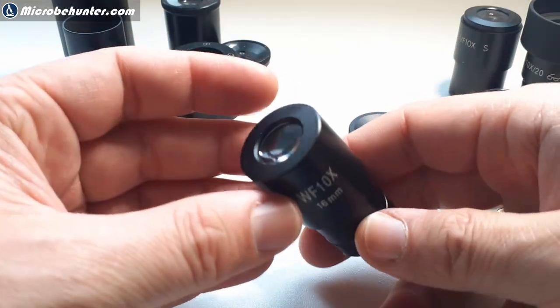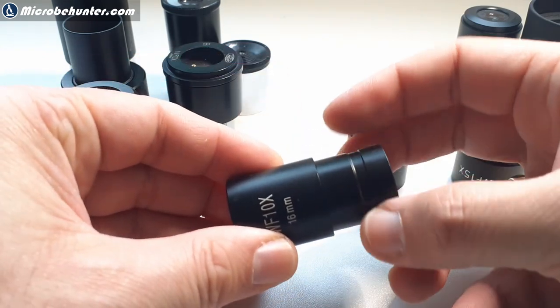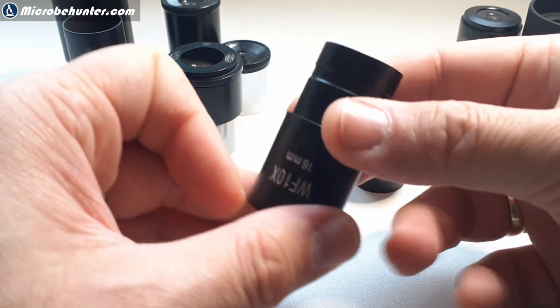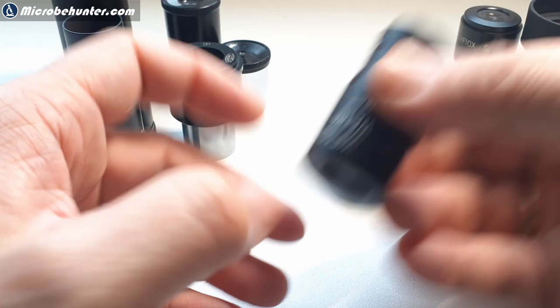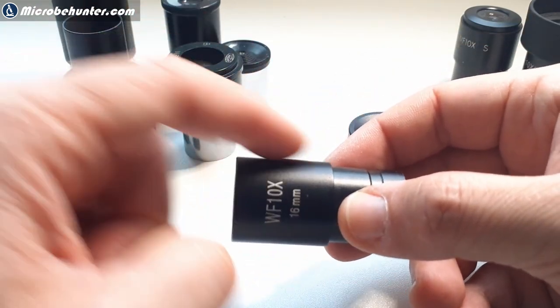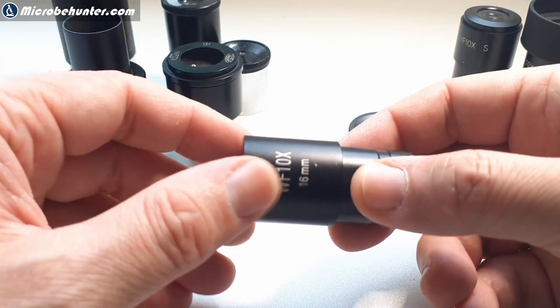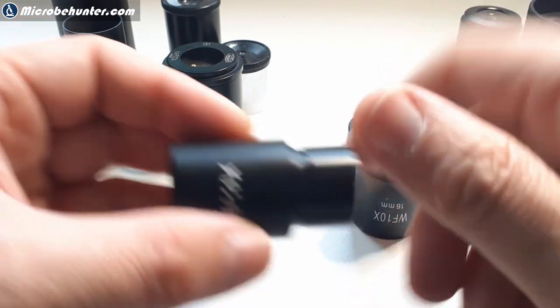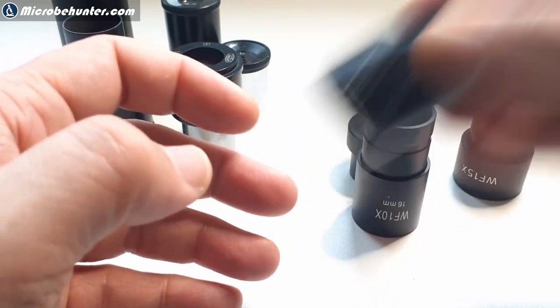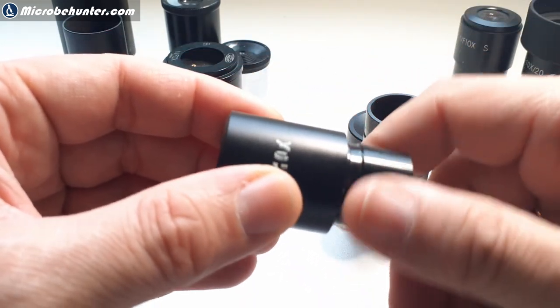Last but not least, I want to show you something. When you take this eyepiece and unscrew it a little bit - not completely - and shake it, you can hear the lenses become detached. With other eyepieces this is not the case - you shake it and the lenses are still held in place because they're connected differently. So when lenses fall out, you have to know the correct orientation to put them back.